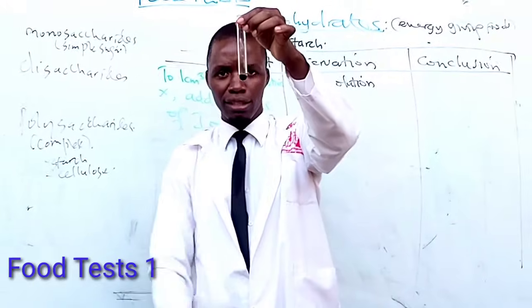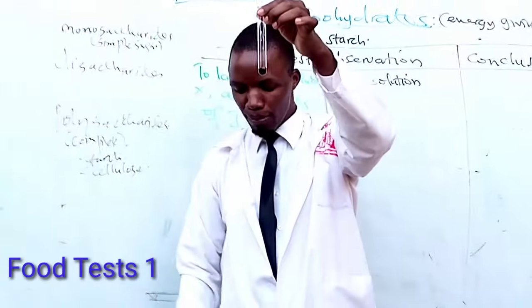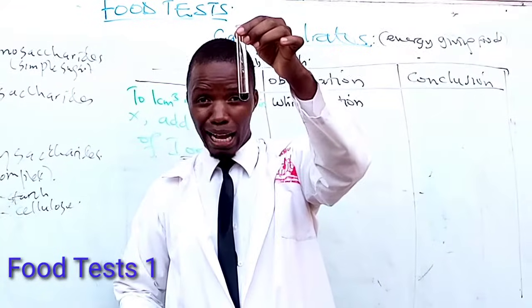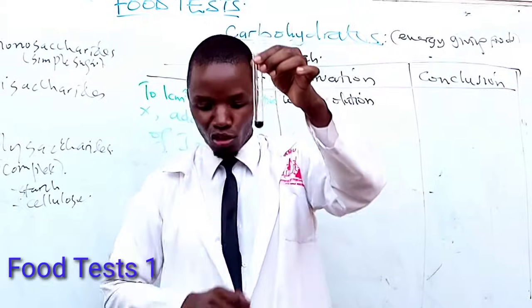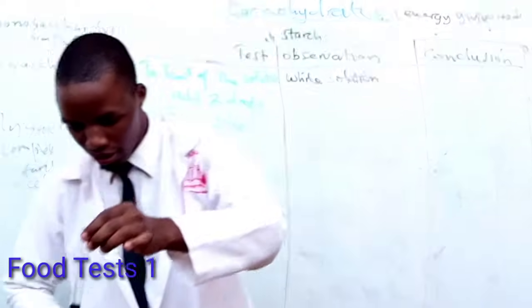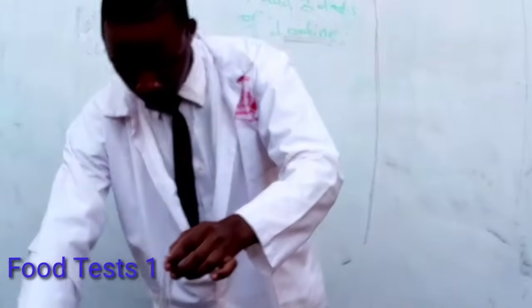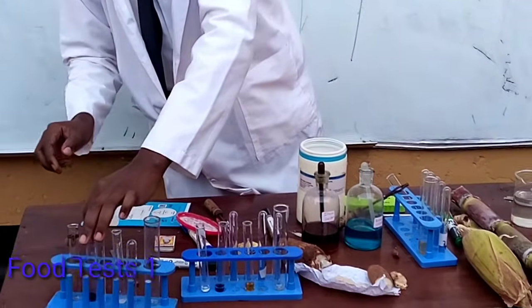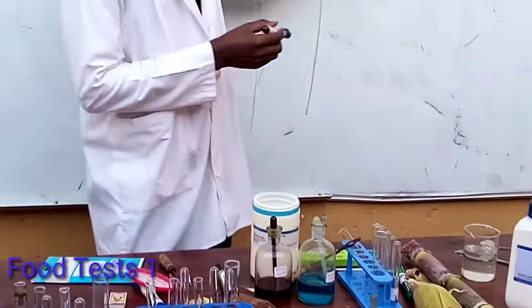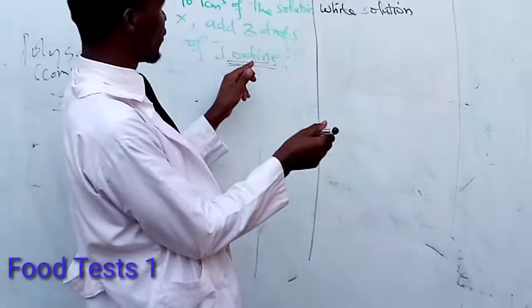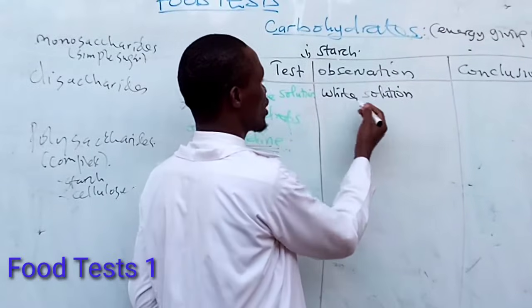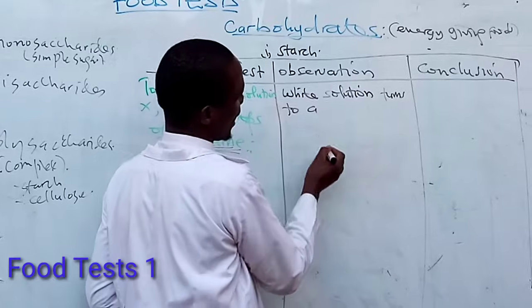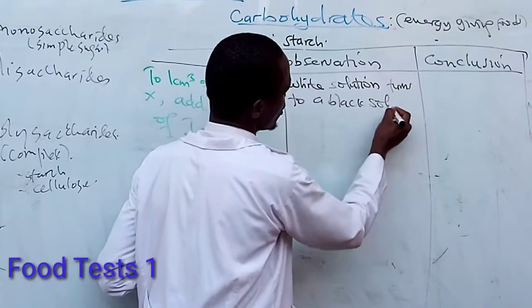I don't know what you are seeing there, but according to what I'm seeing here, I'm seeing something which is black — a black solution. So it means that when I have a white turbid solution and I add three drops of iodine, this white solution turns to a black solution.